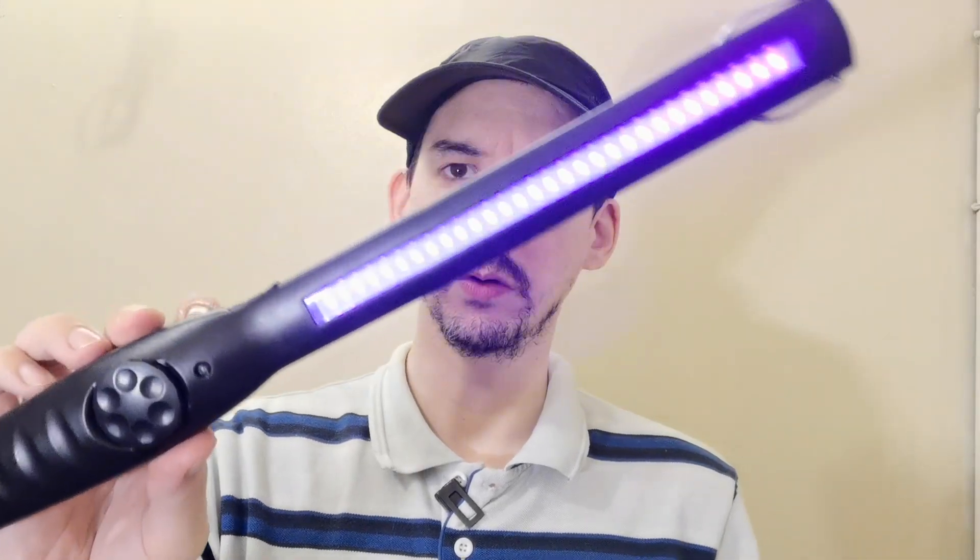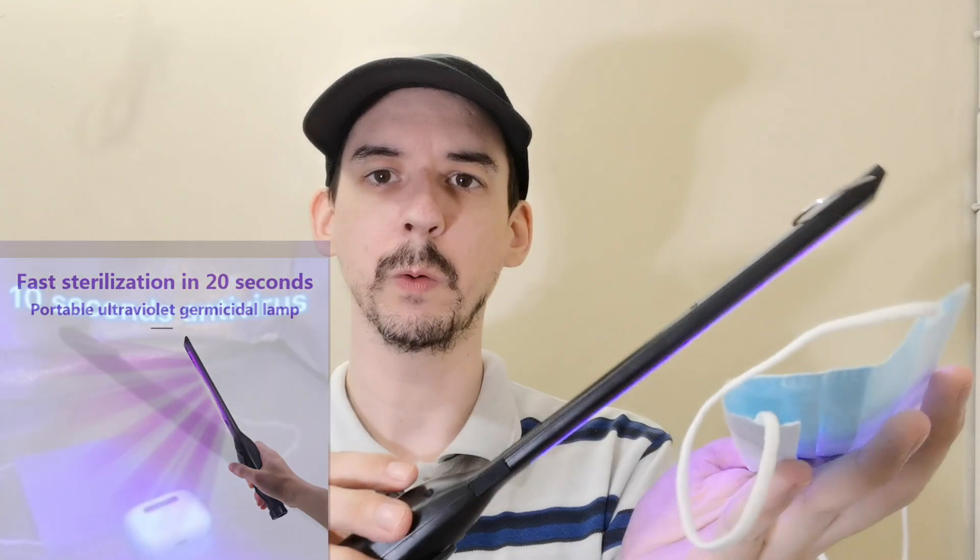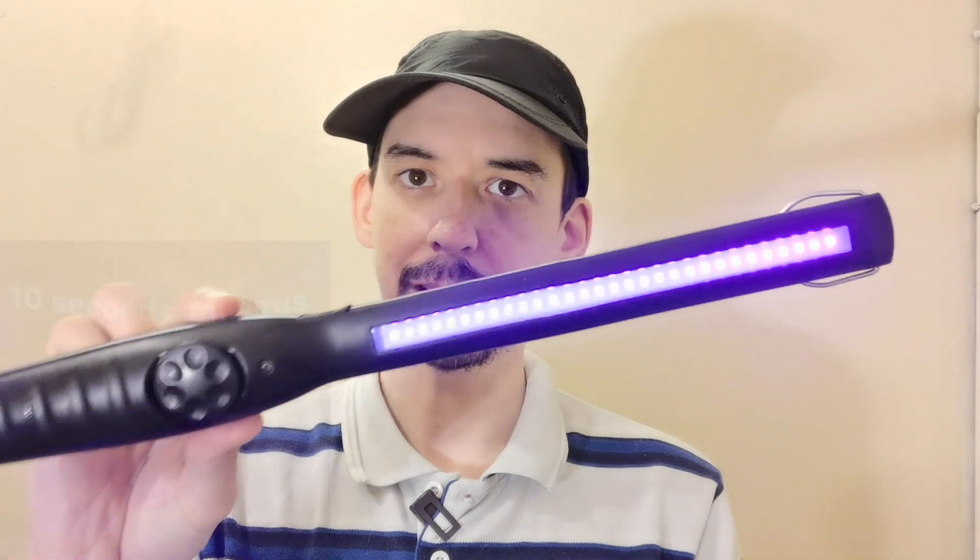After 48 hours, this is the comparison. Good morning everyone. Are you or someone you know using a UV wand like this? They claim it can disinfect a face mask, cell phone, keys, and other small objects in just 10 to 20 seconds. But how do you know if it's really working?